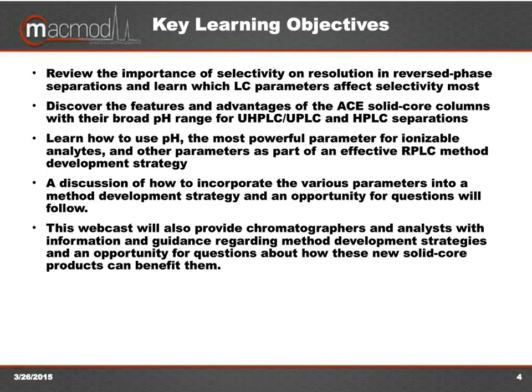These are the key learning objectives that we presented in the announcement for this webinar today. First, we will revisit the importance of selectivity and resolution in reverse phase separations, and then we will look at which LC parameters affect selectivity most for both isocratic and gradient separations. I will introduce and describe the features and advantages of ACE's new UltraCore solid core columns with their broad pH usability for UHPLC and HPLC separation.